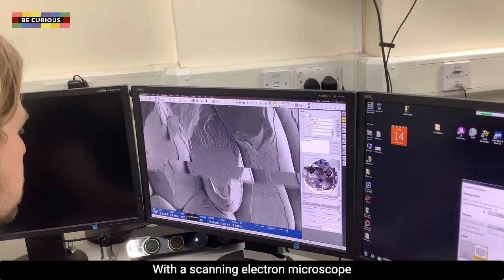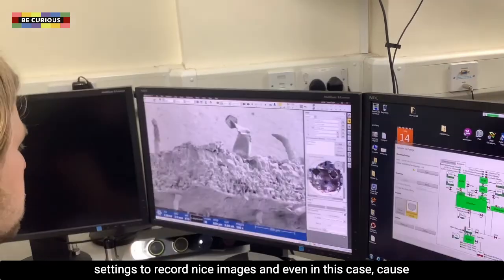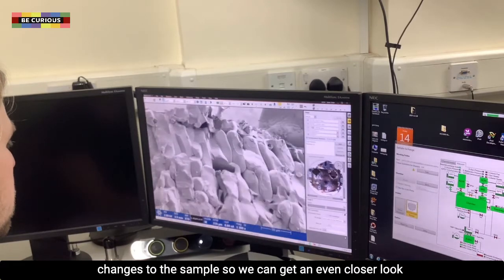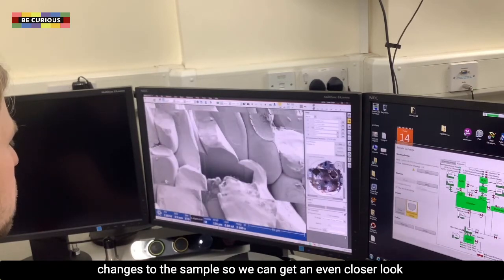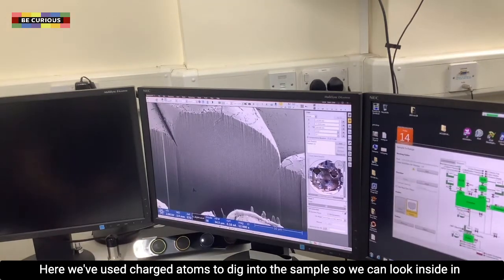With the scanning electron microscope we can continue to increase the magnification, change our settings to record nice images, and even cause changes to the sample so we can get an even closer look. Here we have used charged atoms to dig into the sample so that we can look inside in even more detail.